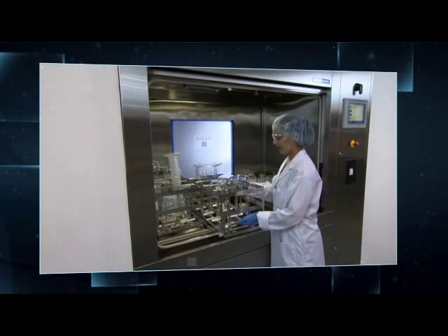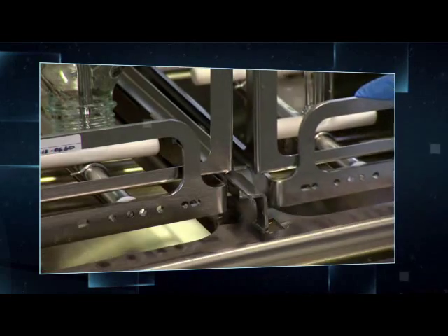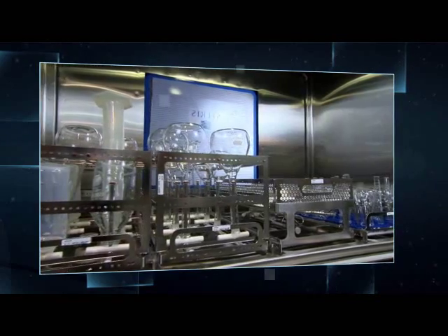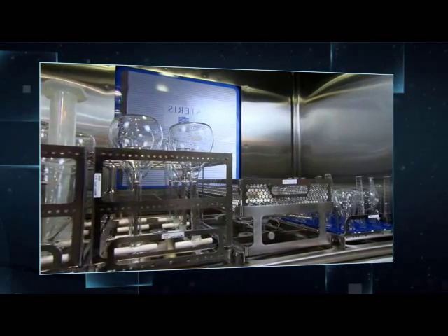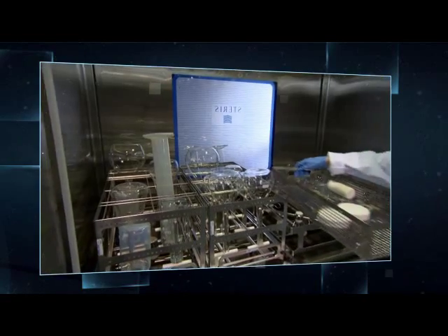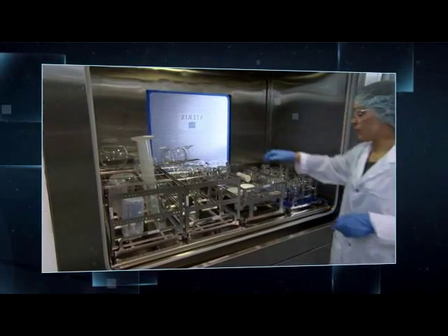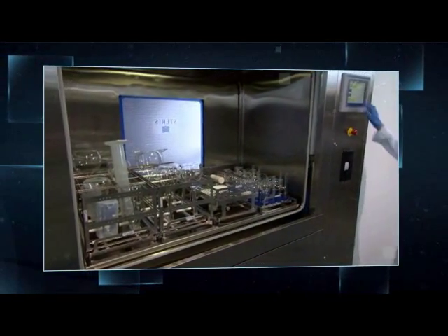The Reliance 480PG pharmaceutical grade washer is a highly efficient and complete solution that can handle most component cleaning and drying challenges in your pharmaceutical manufacturing facility. When combined with Steris' unmatched global service capabilities and scientifically proven formulated chemistries, the Reliance 480PG washer will help you meet your processing and productivity goals.